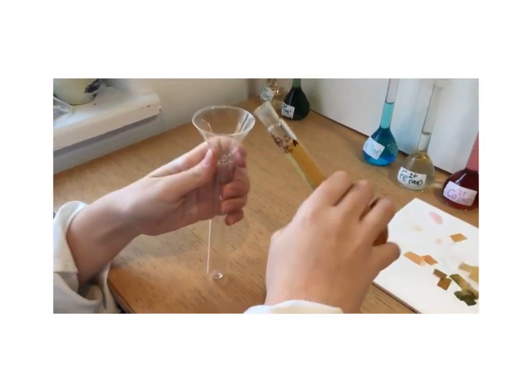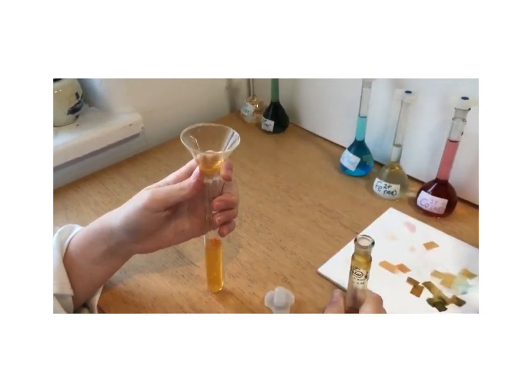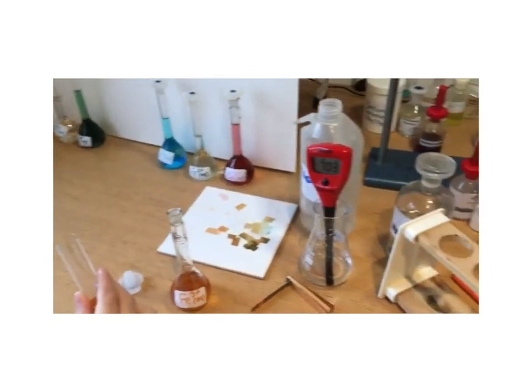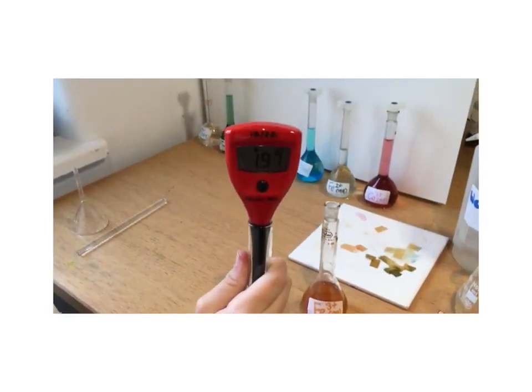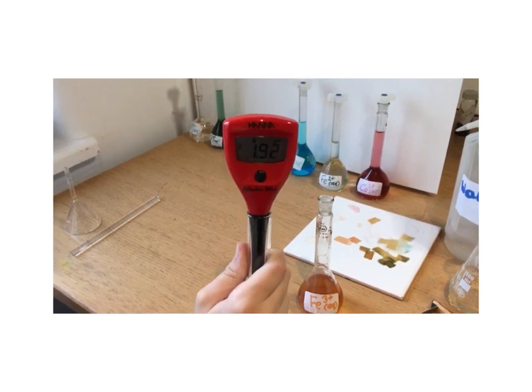Here, Rianne has taken some iron 3 solution, which you can see is orange. What she's now going to do is use a calibrated pH probe. You can see there it's reading pH 7, and she puts it into the solution of Fe3+ ions. And surprisingly, the pH now drops to 1.9, so it's about pH 2.